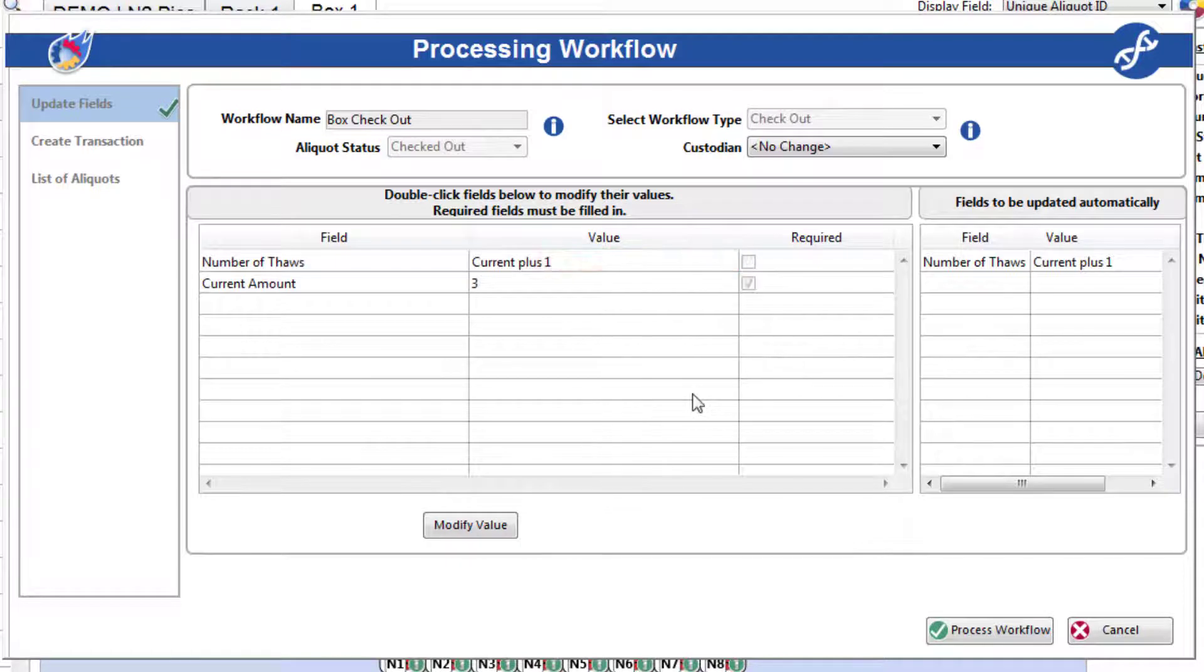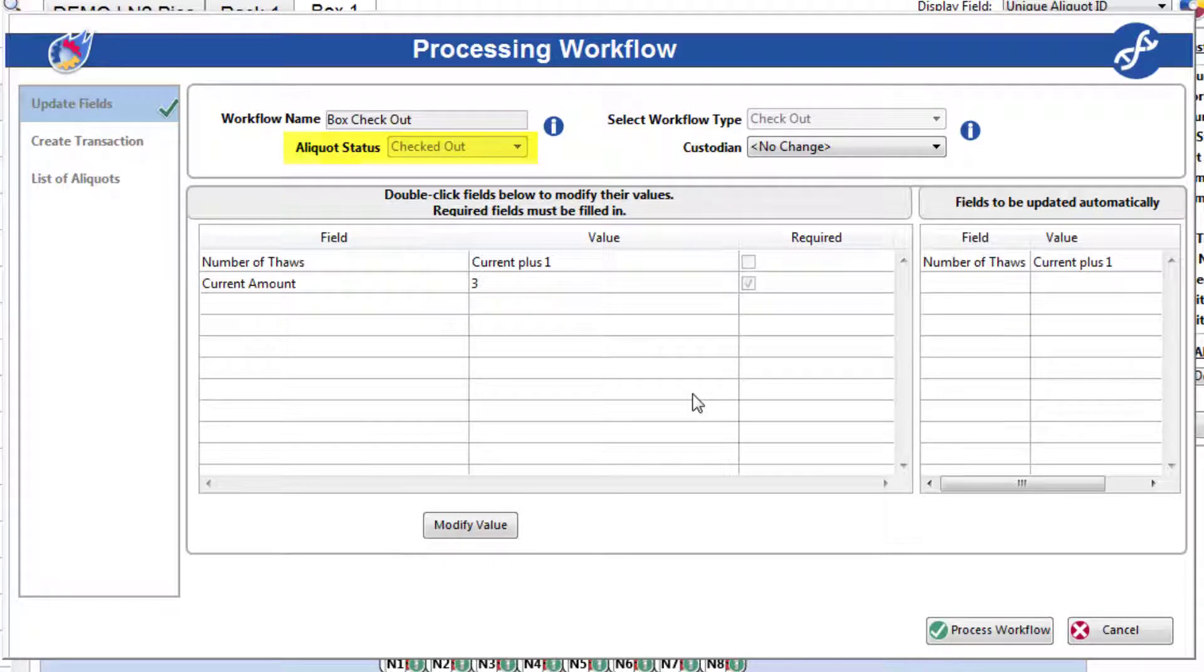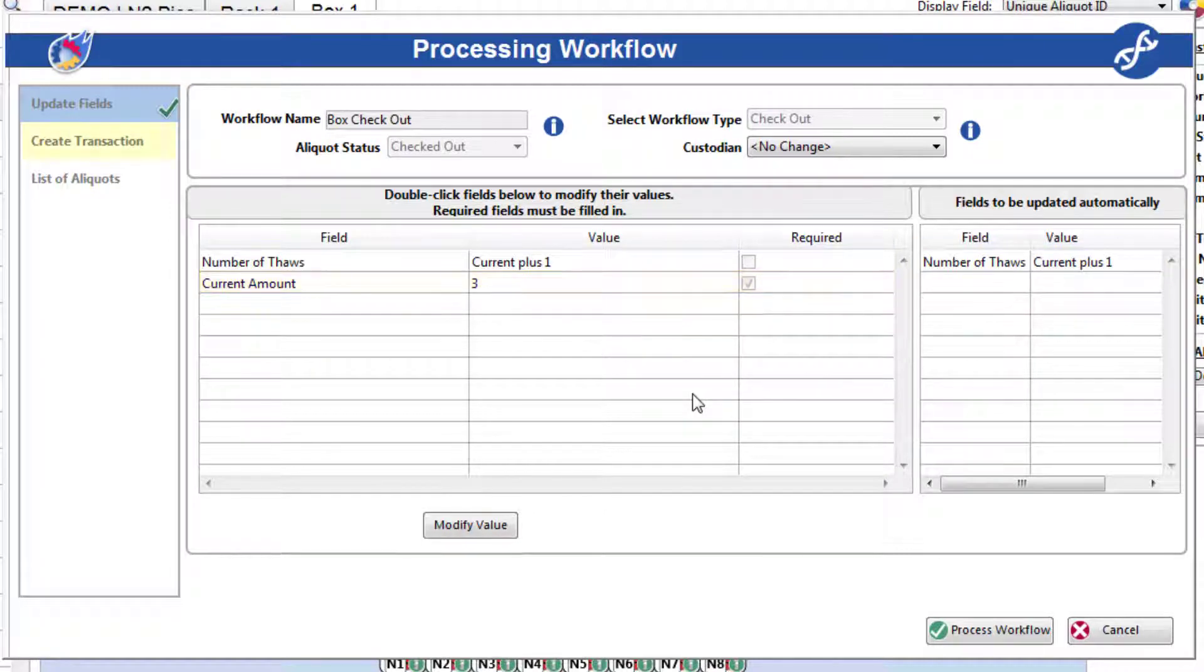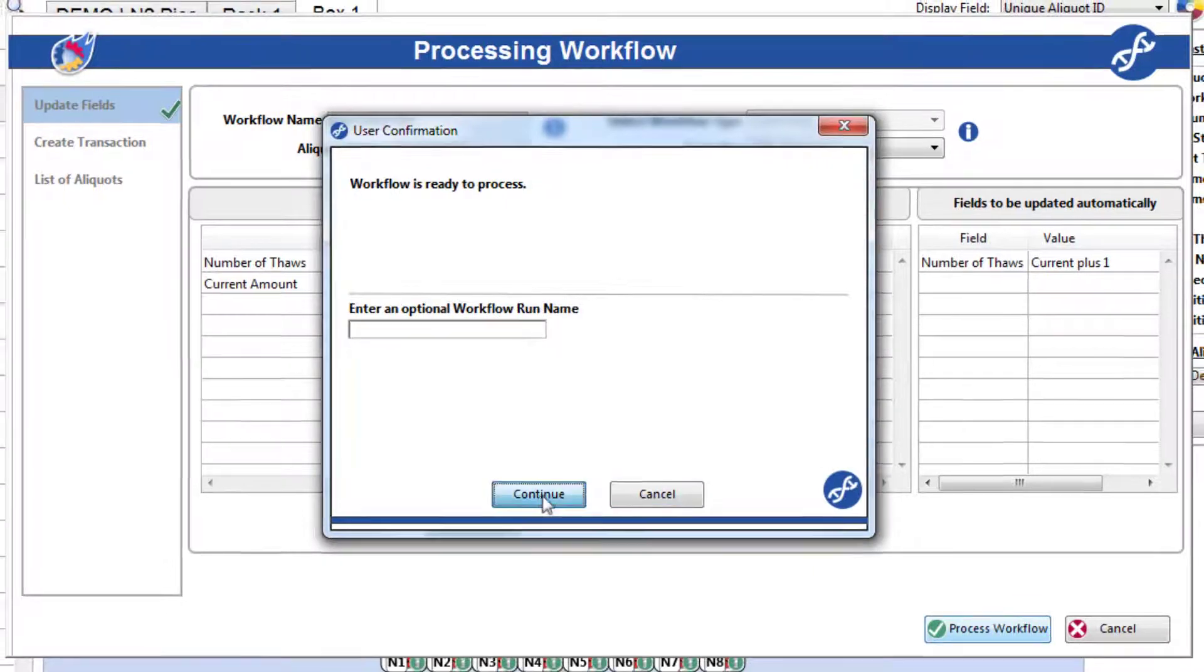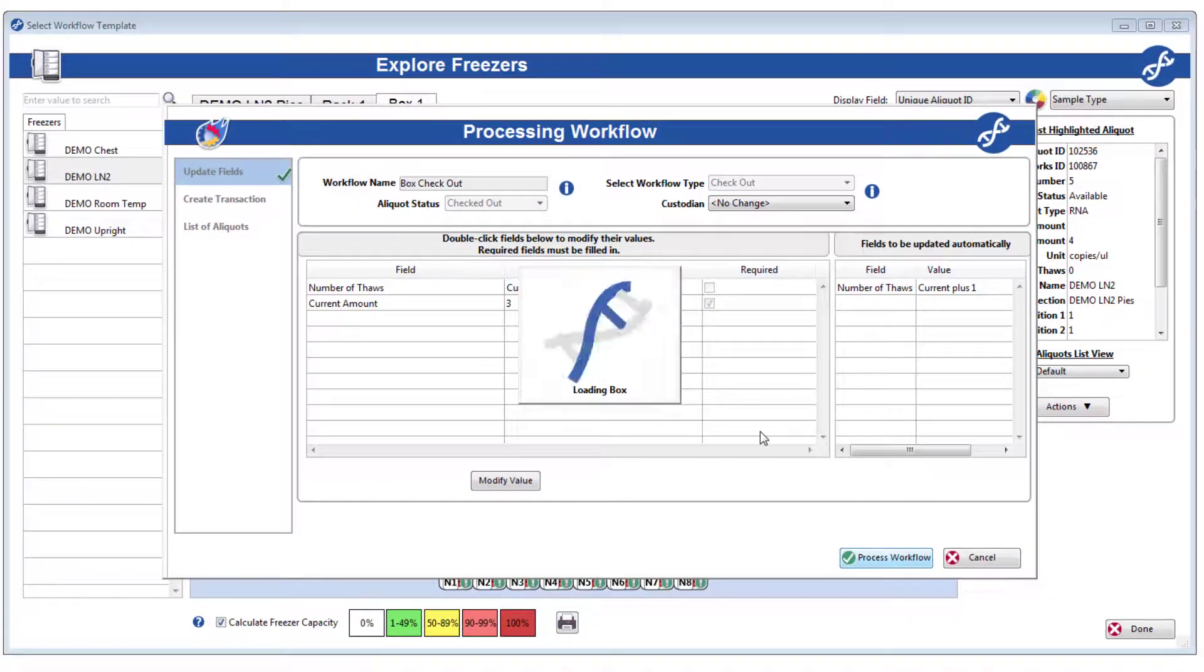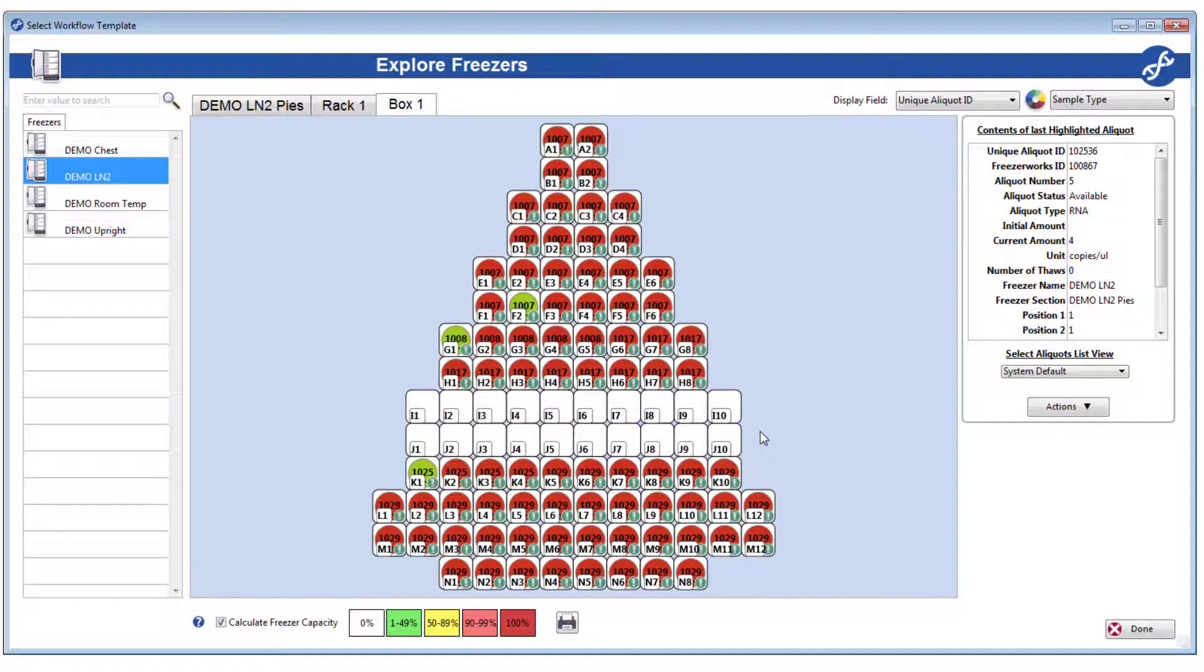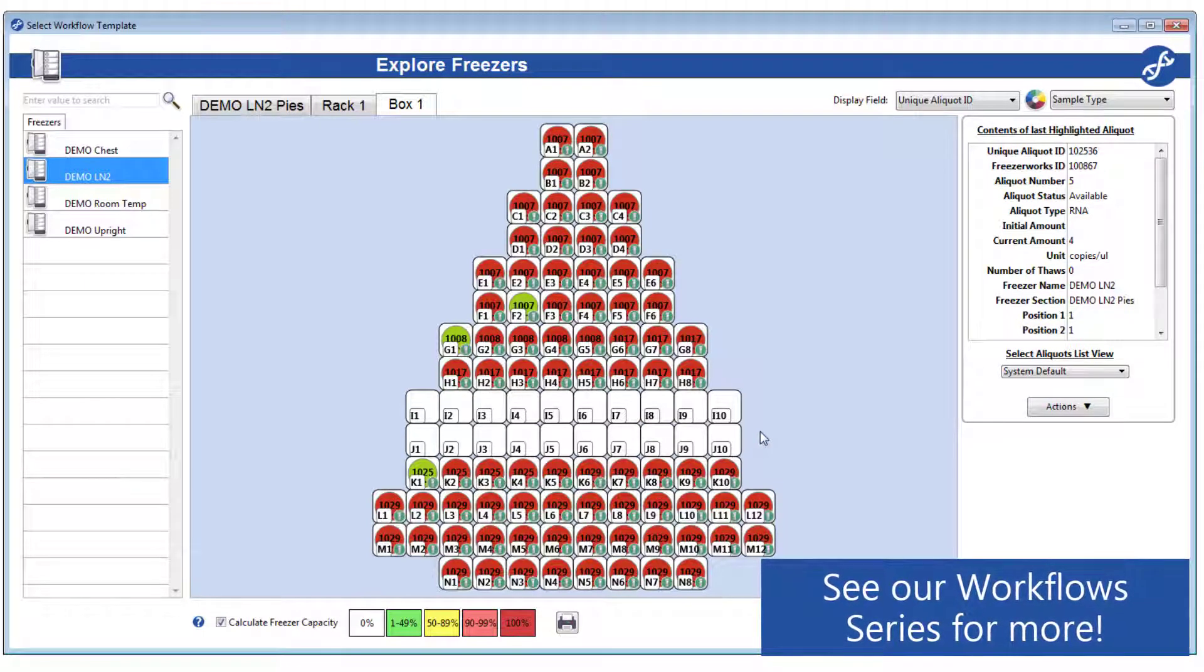So, when I click Process Workflow, all of the following will happen to each aliquot I selected. The aliquot status will be changed to checked out, the number of thaws will increase by one, the current amount will be updated, and a transaction will be created. Lastly, the aliquots will be removed from the freezer. Like so. All of this through a single prescribed action. We have a full video series on workflows if you want to learn more.